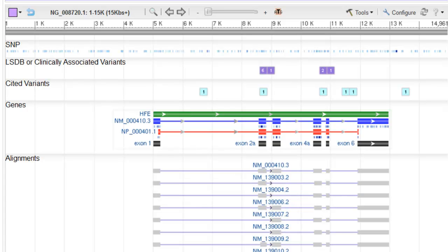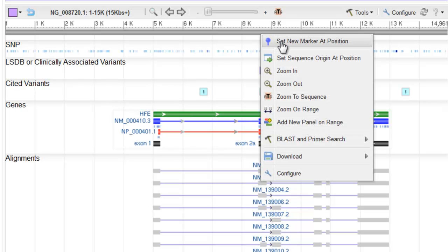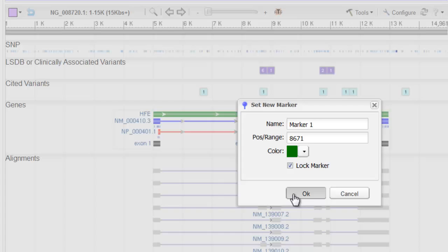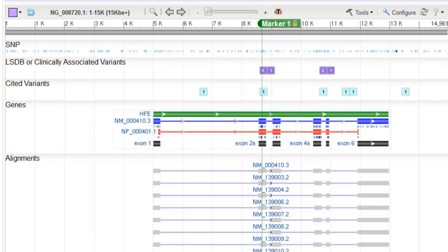Let's say you know the location of a variation on a RefSeq gene, and you want to determine its HGVS name on the cDNA or protein records. Right click in the ruler area and select Set New Marker at Position. You can name the marker. I'll just enter my known location, 8671, and check Lock Marker. When you press OK, the dialog closes, and you see the marker's location on the displayed features.